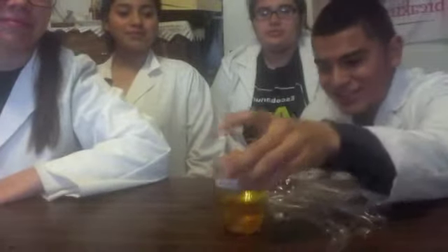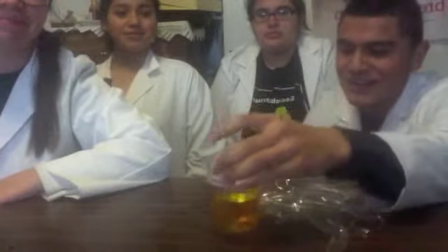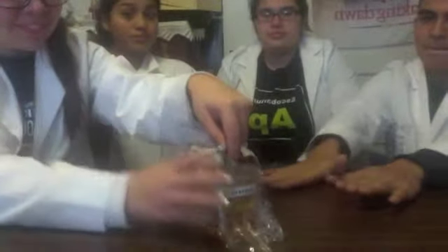The next step is adding 30 milliliters of ethyl acetate into the tea beverage. With your handy-dandy glass pipette, you will add 30 milliliters of ethyl acetate into the tea beverage. After you add the ethyl acetate, you shake it gently, and you cover it with parafilm. After covering, poke a hole in the parafilm to release all vapors that are being created while the mixture settles.